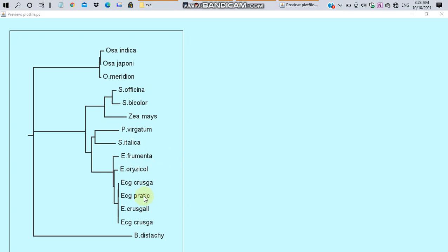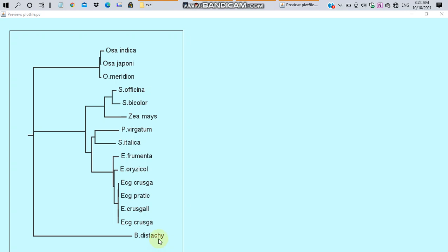In the Japanese barnyard millet 2, Echinochloa crusgalli variety crusgalli and Echinochloa crusgalli variety praticola are closely related. In this tree, Brachypodium distachyon serves as an outgroup. All the 15 chloroplast genomes are derived from the same common ancestor.